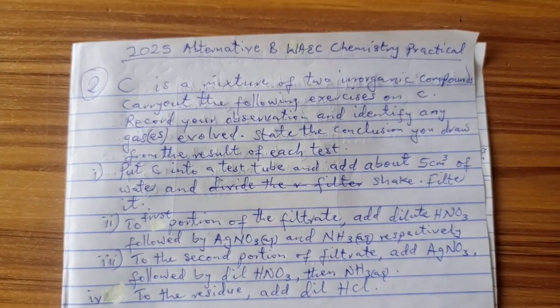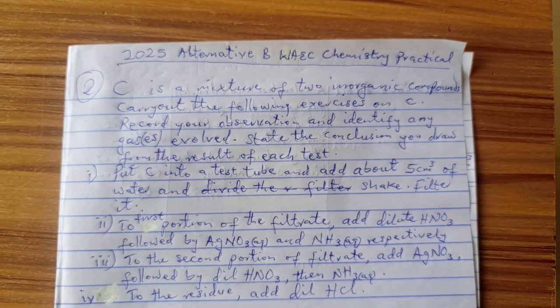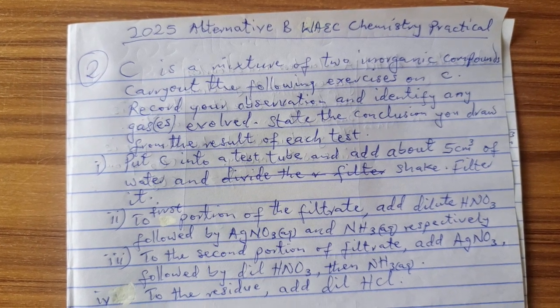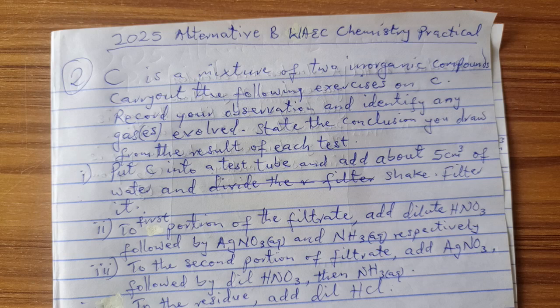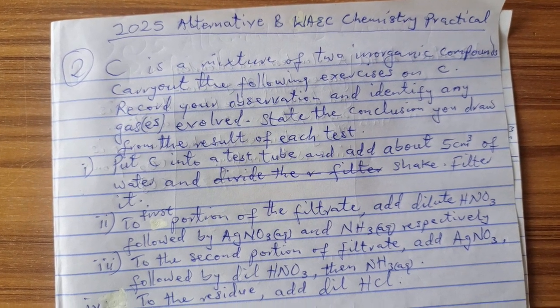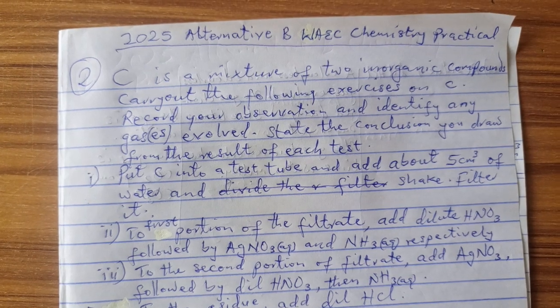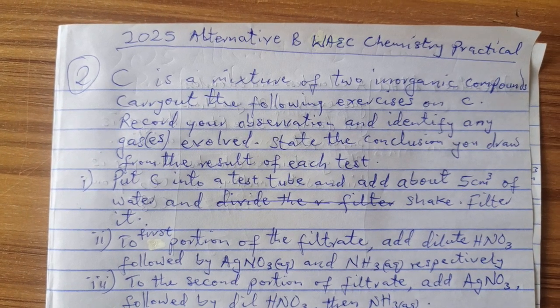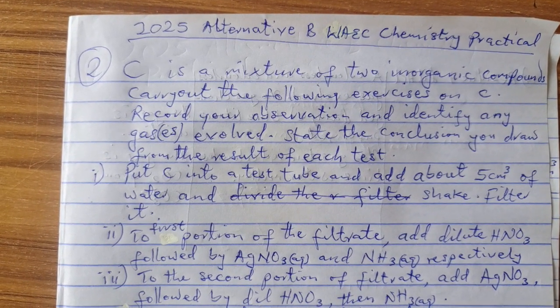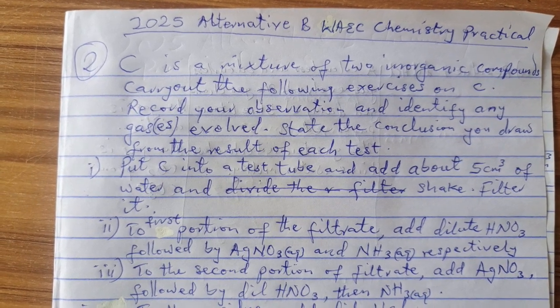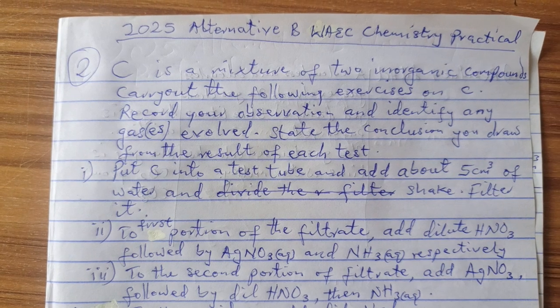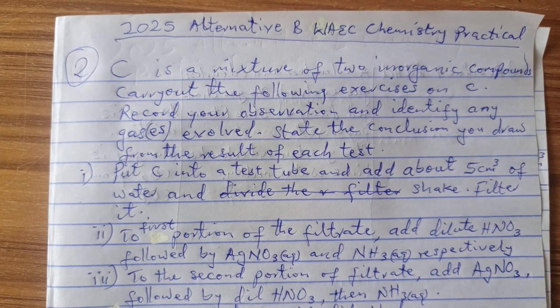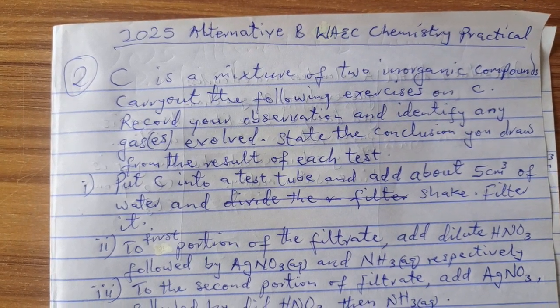Welcome once again to our today's chemistry class. In our class today we are going to be dealing with 2025 alternative B WAEC chemistry practical question 2. I have handled question 1 in our last class and I ask you to look for similar questions and attempt so that by the time you get in there it will be very simple for you. So now coming back here to today's class, we are going to deal with question 2.